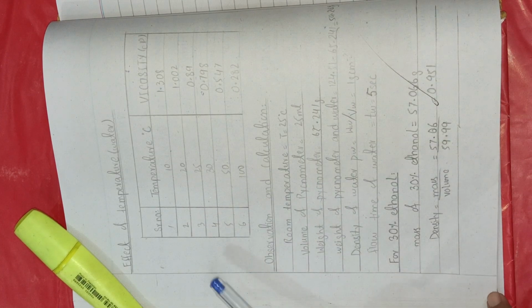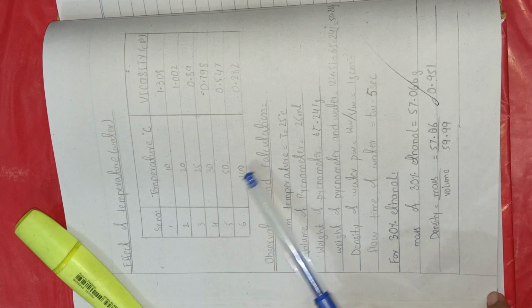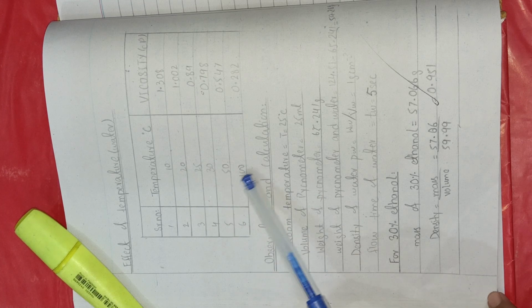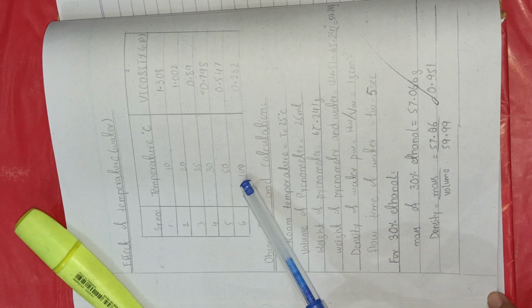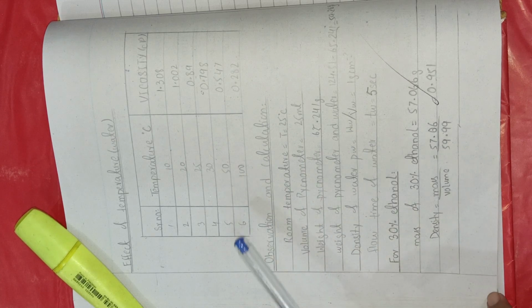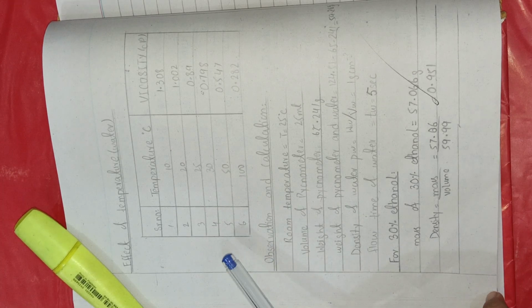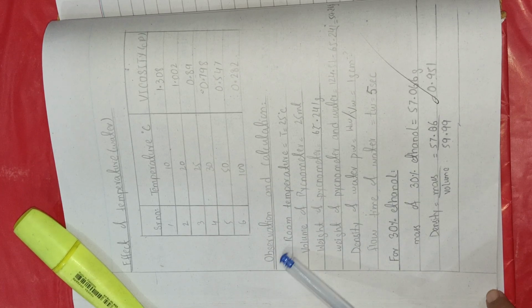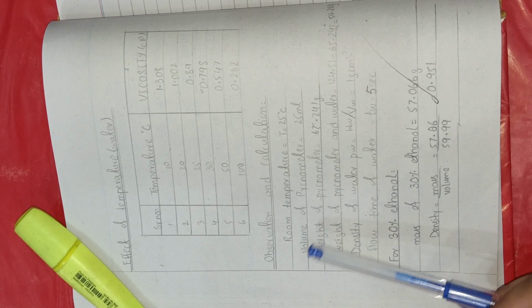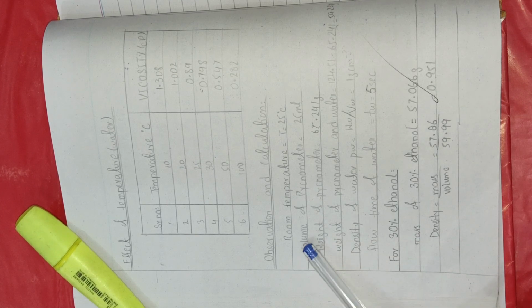Here a table is given to you, and in that table it is explaining the effect of temperature on the viscosity. So you see here the temperature increases from 10 degrees to 100 degrees centigrade, and this is the viscosity, and you can see the relation of temperature and viscosity, and you can find out how temperature can affect the viscosity of a particular substance. Now you are going to discuss the observation and calculations, and we are going to calculate a viscosity. You should keep the temperature at room temperature. That is very important because temperature is going to change your viscosity.